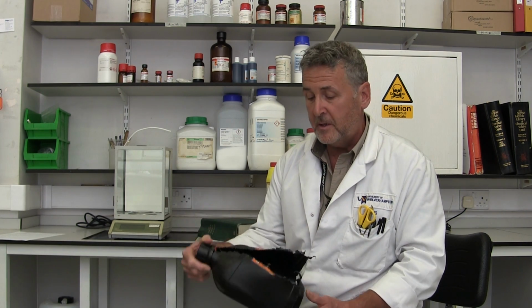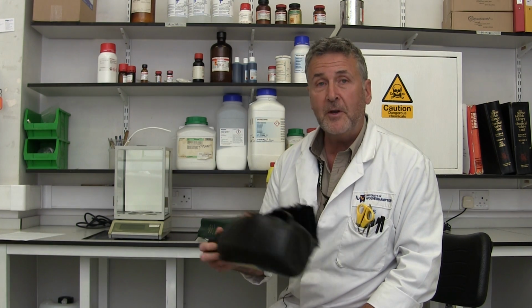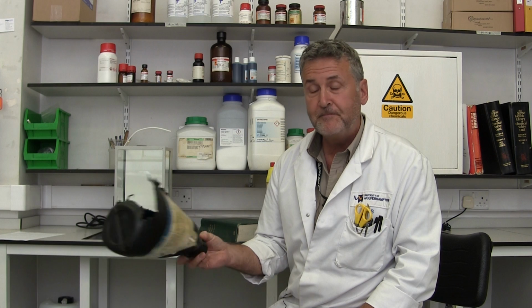Oh, it'll do, I'll tip it in here. Unfortunately, it wasn't empty, it hadn't been rinsed out. And the two chemicals were an example of something that shouldn't be mixed together. And fortunately, a member of the technical staff on site actually noticed the plastic bulging, threw it quickly into a safety cabinet where it burst, like that.